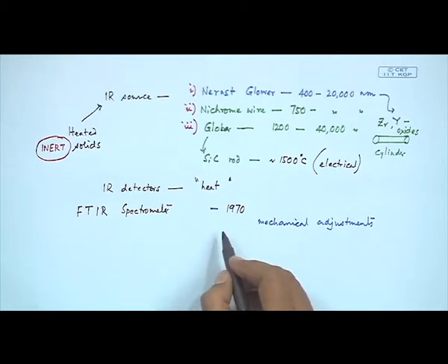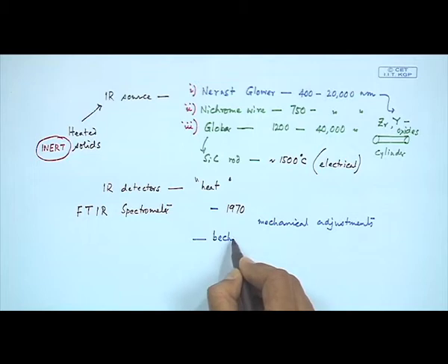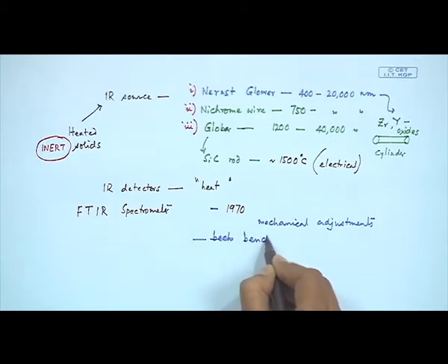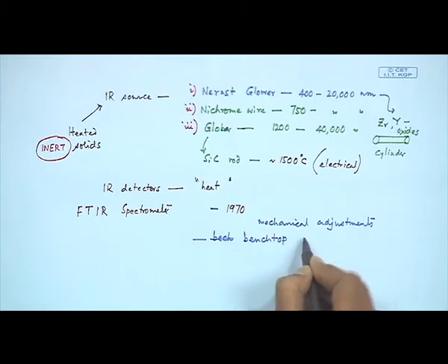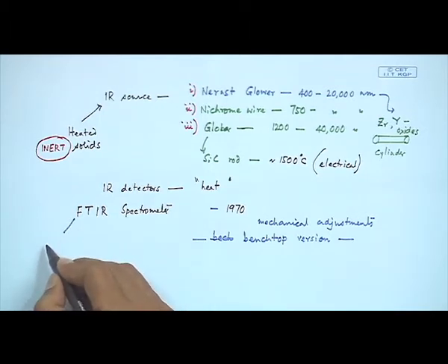So currently these are available as a bench top version, and it uses a mathematical technique named after Fourier.